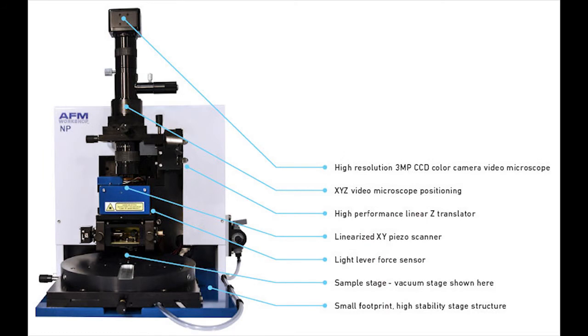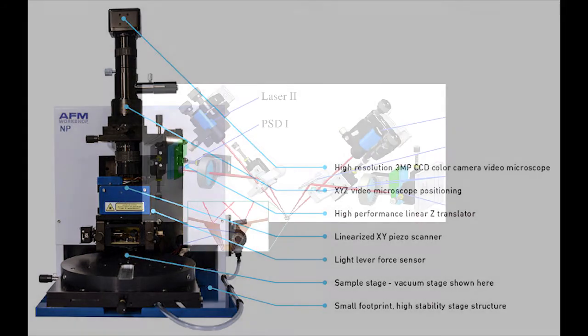Scanning speed of an AFM is also a limitation. Traditionally, an AFM cannot scan images as fast as an SEM, requiring several minutes for a typical scan, while the SEM is capable of scanning at near real time, although at relatively low quality. The relatively slow rate of scanning during AFM imaging often leads to thermal drift in the image, making the AFM less suited for measuring accurate distances between topographical features on an image. However, several fast-acting designs were suggested to increase microscope scanning productivity, including what is being termed video AFM.